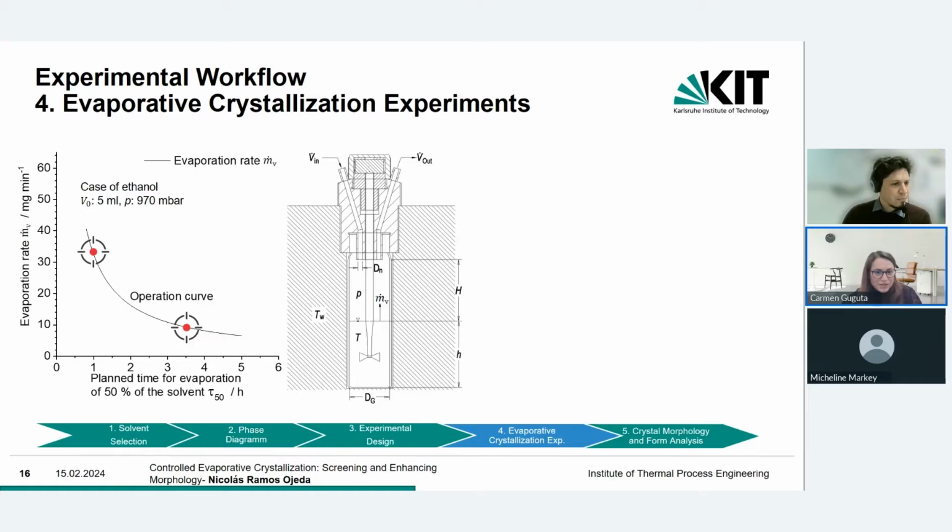Dear Nicolás, is this Technobis system continuous in your experimental design, or do you take the samples and measure in a different place? I'm not sure which experimental setup is meant, but if it means the operation, it is not continuous, it's batch crystallization.